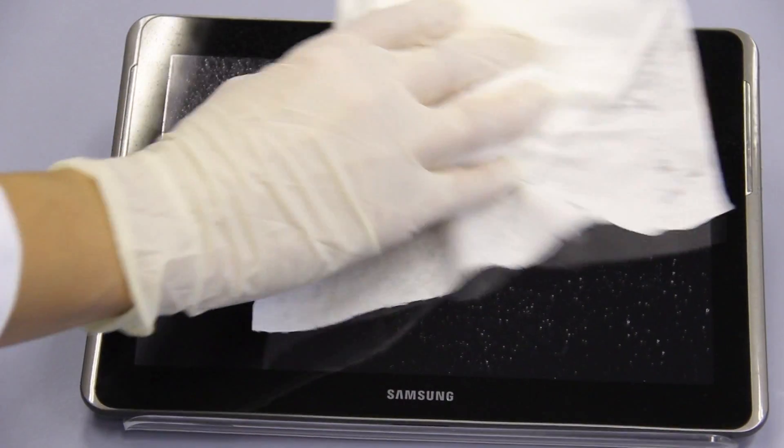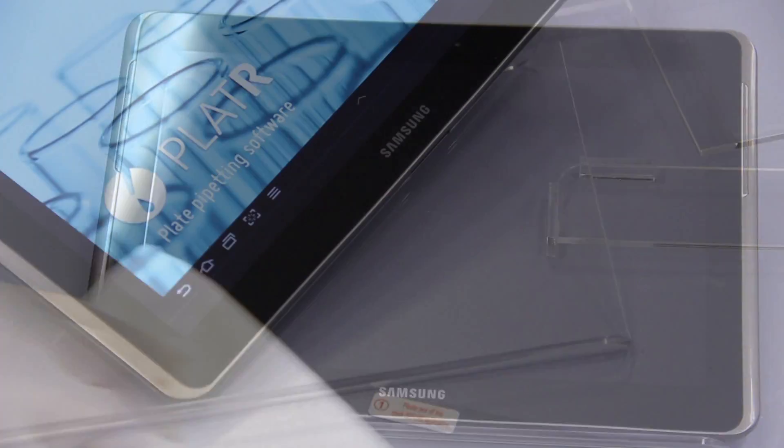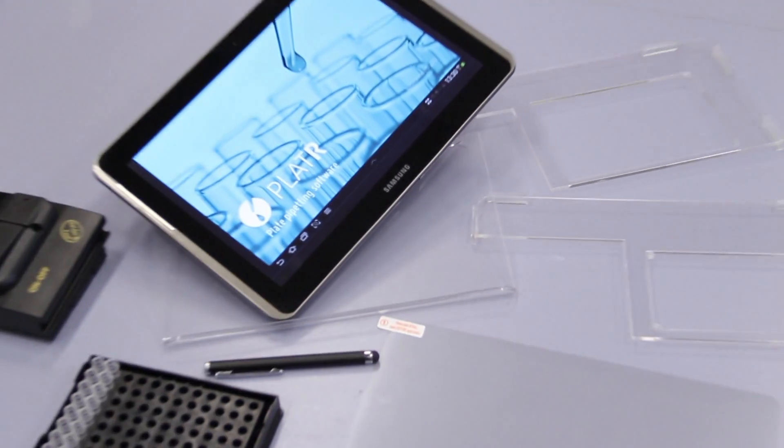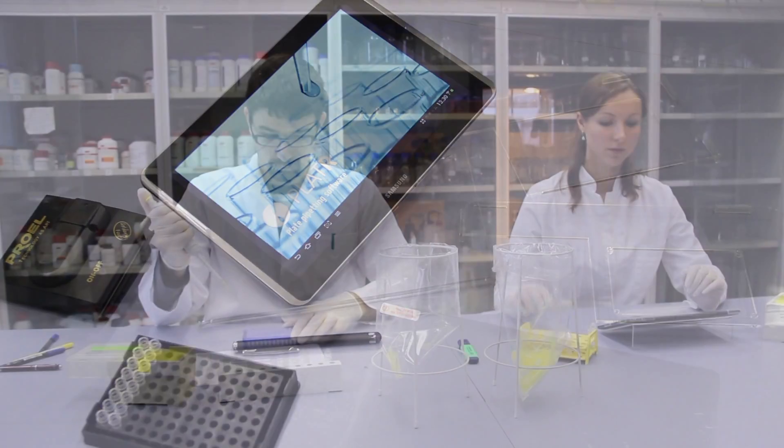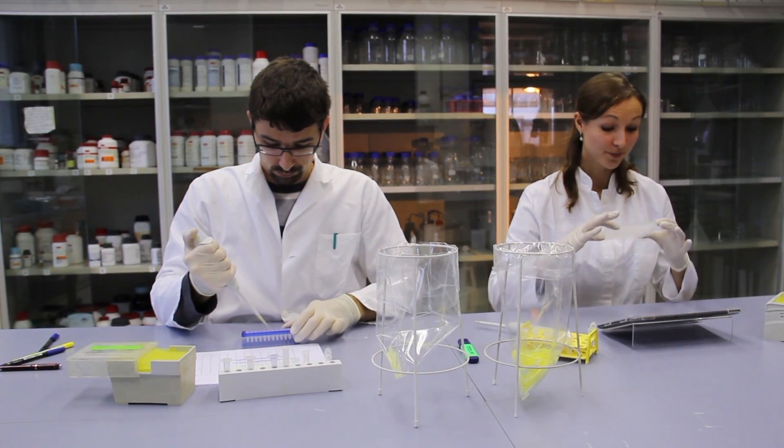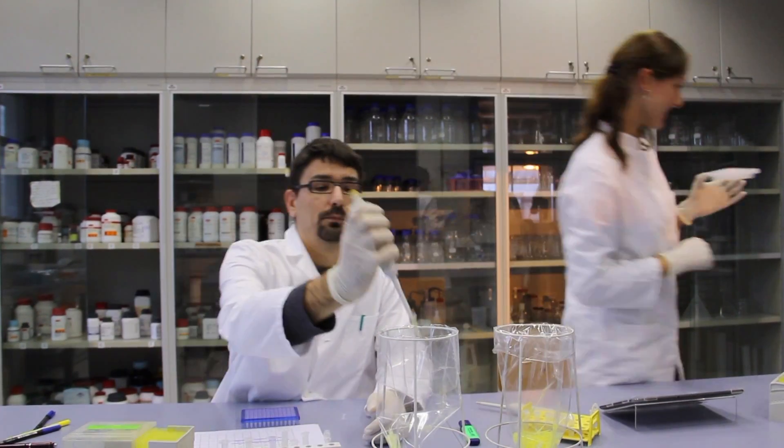You can use DNA remover and similar chemicals to reduce the risk of cross-contamination. It is suitable for various applications such as PCR, qPCR, and ELISA. Using Platter, your work will be faster and more relaxed. This simple lab solution can finally take the pressure off.